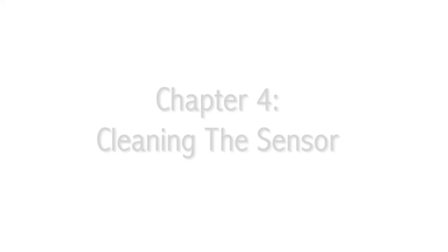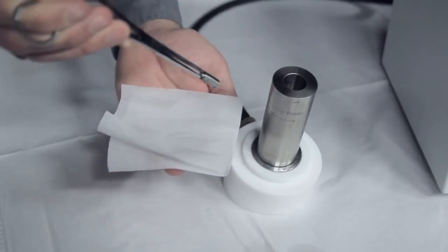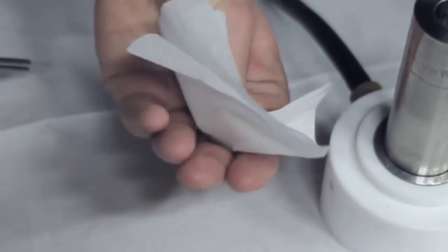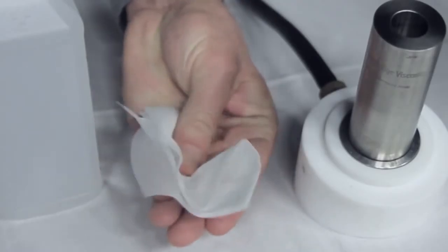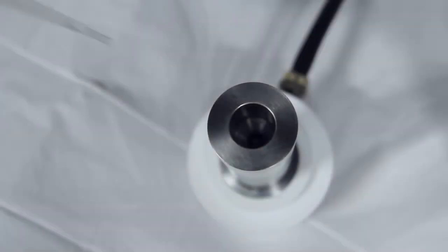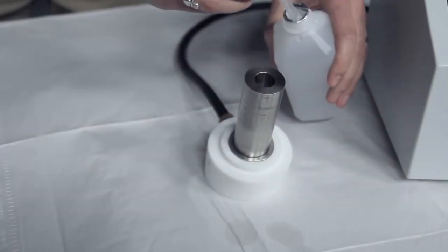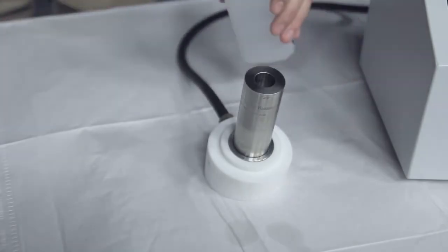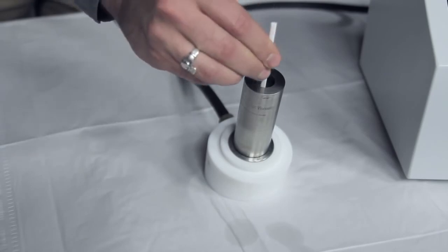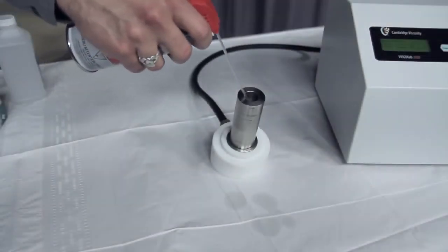Chapter 4: Cleaning the sensor. Use forceps to grab the piston by its nipple and slowly pull the piston out of the sensor. Use a kimwipe or a lint free tissue to wipe the sample off of the piston. Use solvent to clean the piston. Insert the pipette into the measurement chamber and squeeze the pipette to remove as much sample as possible; repeat as necessary. Add a splash of solvent to the measurement chamber to clean the residual sample material. Use foam tip swabs to clean the measurement chamber, repeating as necessary until the chamber is fairly dry. Blow-dry the measurement chamber with compressed air.